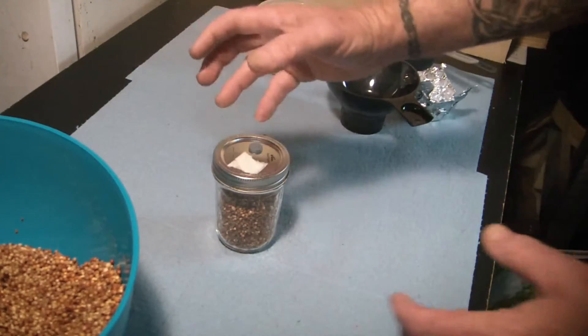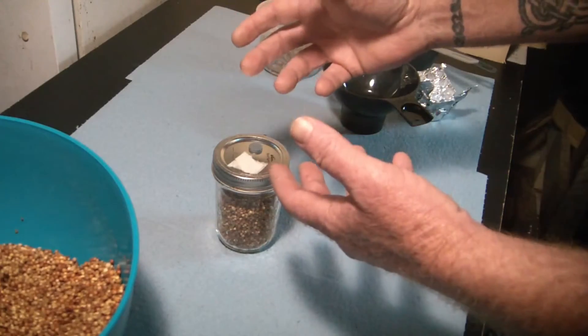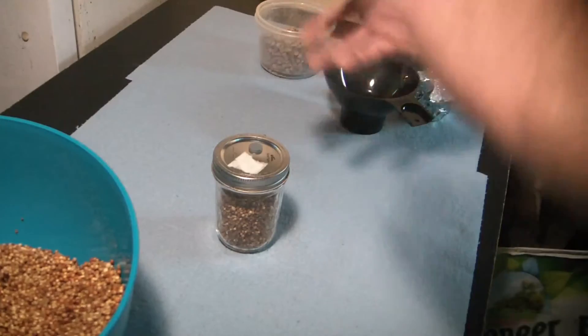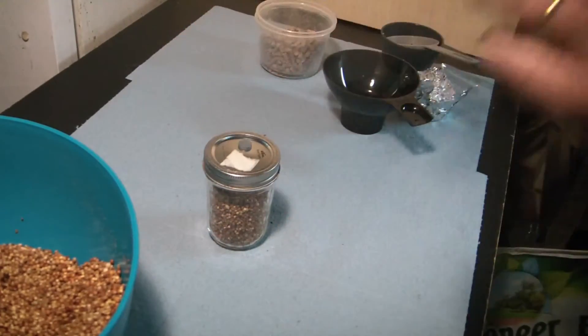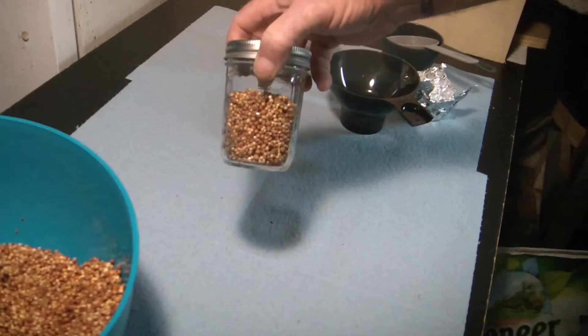Don't shake like crazy when you're mixing up grain-to-grain, or if you're breaking up or mixing a jar at 25-30%, just break it up and mix it. Don't shake the crap out of it — that can really damage your mycelium. It really can make a difference.